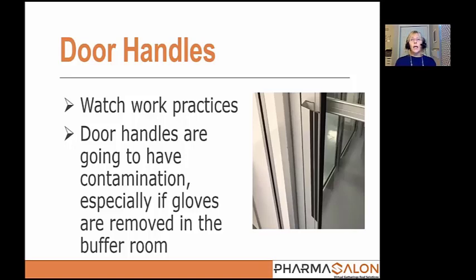Depending on how the door pulls and where you don your gloves, it might be a huge contamination source, at least from the standpoint of if you wash your hands in the ante-room, right, you don your gown and then you don't put gloves on until you get into the buffer room, you touch that handle and open, even though you did a good job washing your hands, you're still going to have microorganisms on that door handle.